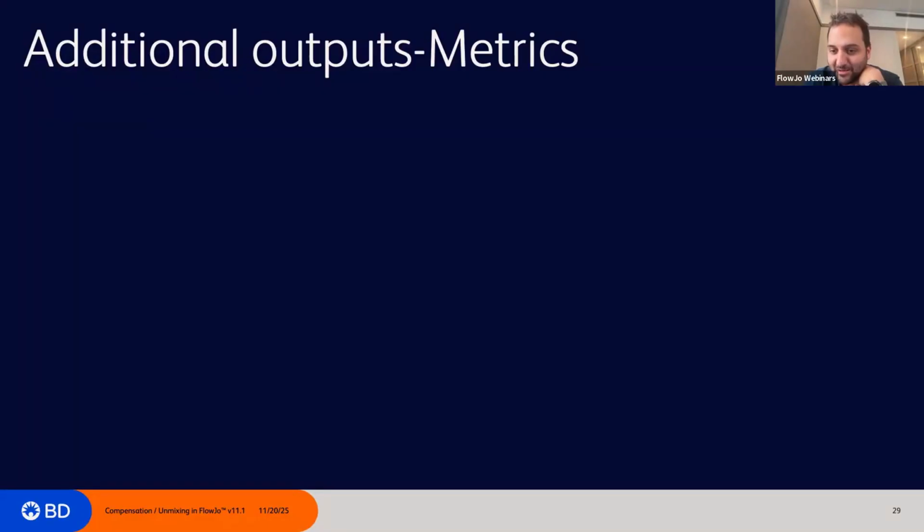Alexis, hi, good evening, is asking if unmixing is done with weight optimization or not. In version 11, no, we don't have the weight optimization. Not yet. I don't know if it's in the scope. I'm not sure. But no, this is not used in that case. It's the typical spectral unmixing that we have in version 10 without the optimization.